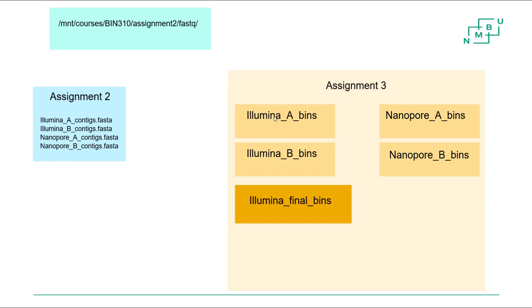So it's really important that the names of the FASTA files with the bins contain an A here and a B here, for instance. That would be a natural separation, right? So that when they end up here, you can tell them apart, even if they have the same number.